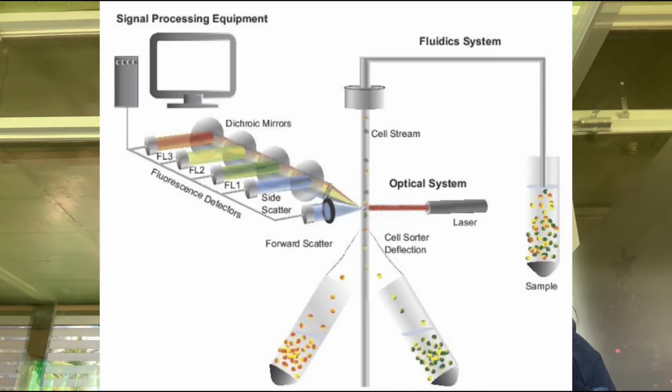Now let us talk about the second system of the flow cytometer, the optical system. The optical system consists of excitation optics and collection optics. The excitation optics is where laser beams are directed towards the flow cell for interrogation of the sample core. Excitation components include the laser beam, shaping prism, and lenses to route the laser beams to the flow cell.